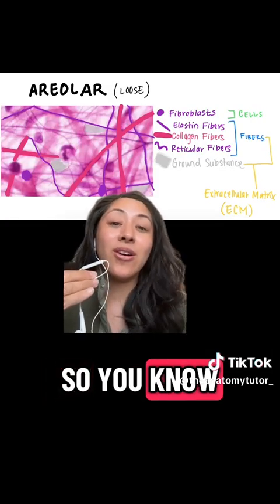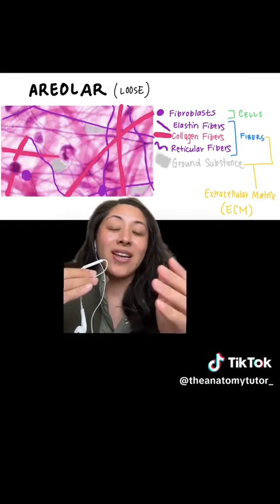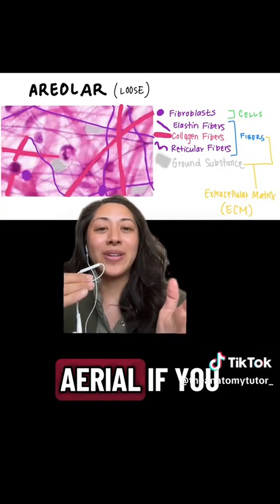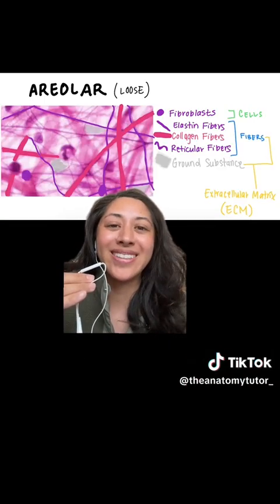So, a little trick is, if you don't know which connective tissue proper it is, most likely it's areolar. If you had to guess, that's a really good default one. So just a little pro tip.